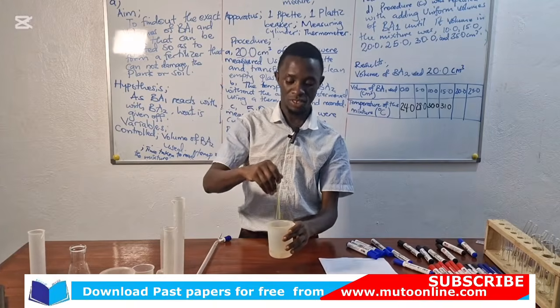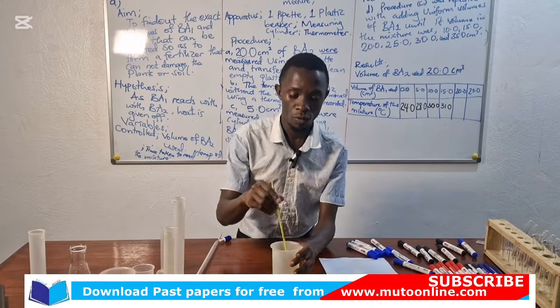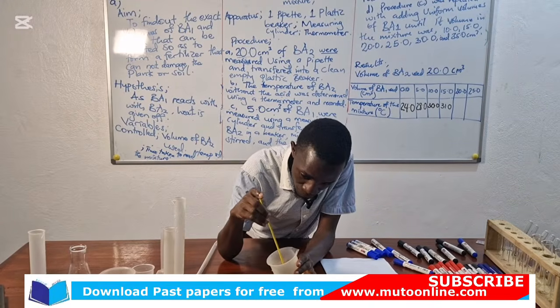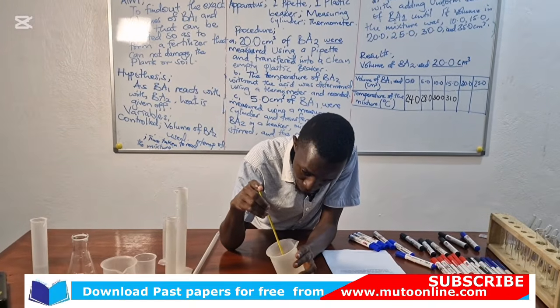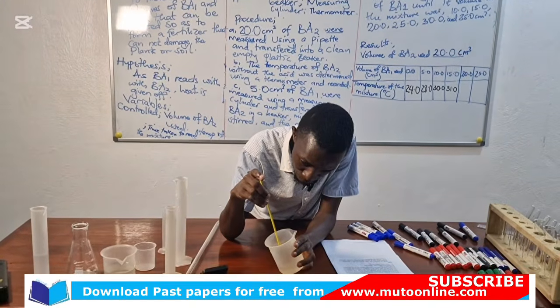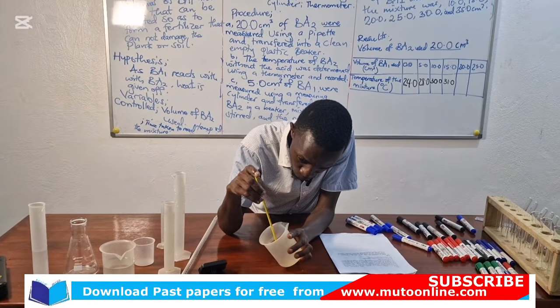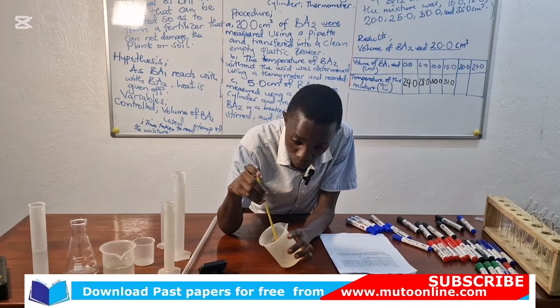So stir the mixture using a thermometer. Ensure uniform mixing of the two. Give the reaction time to proceed. Remember, I started the stopwatch.